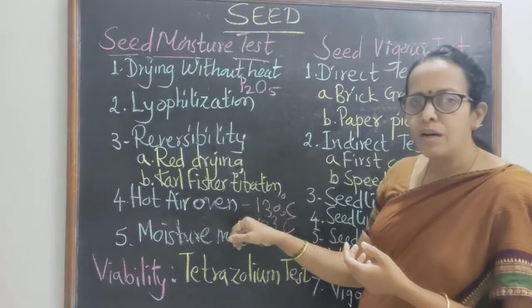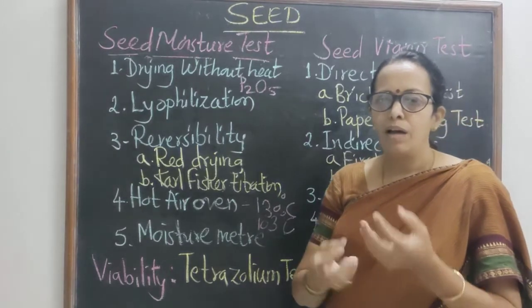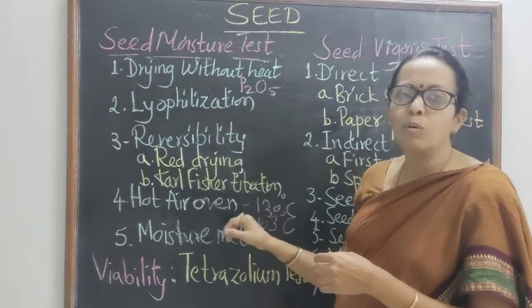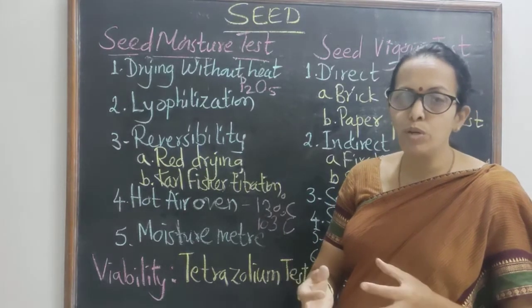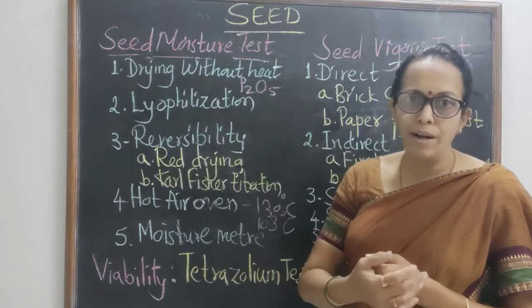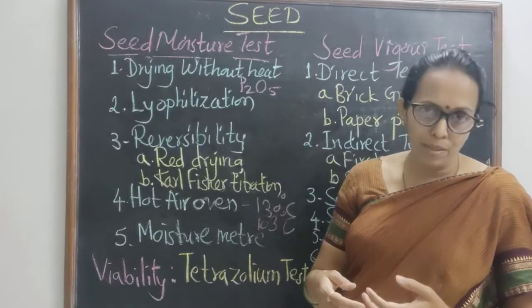After that period, you are going to remove those crucibles from the oven, and after cooling them to normal room temperature, you are going to weigh them again, and the difference between the weights is going to give you the moisture. You convert it to 100, that is the percent moisture you are going to determine from those seed samples.